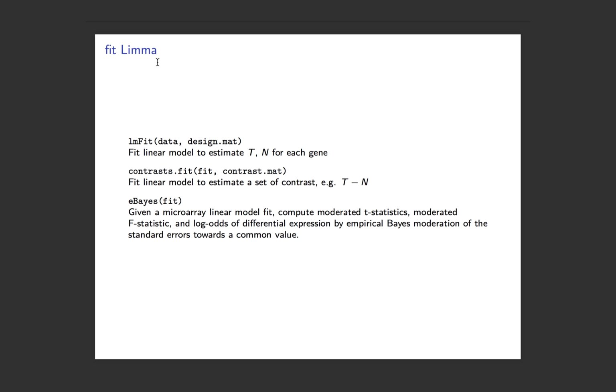To fit limma, we have three major functions. The first one is lmFit.